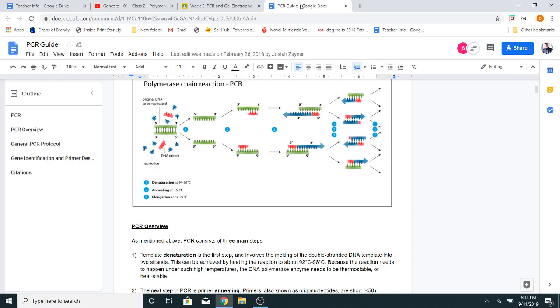Okay. All right. So you're going to have a master mix. Now, the master mix is a mix of things like the polymerase enzyme, which is the enzyme that actually binds to the primer and the template DNA and extends. It's a polymerase, so it makes this polymer, makes the DNA. And so the polymerase that we use is called Taq polymerase, or variations of Taq. It's named after Thermus aquaticus, which is T-A-Q, Taq, because they collected this polymerase from a bacteria in, I think it was Yellowstone. But basically, it's a thermally stable polymerase.